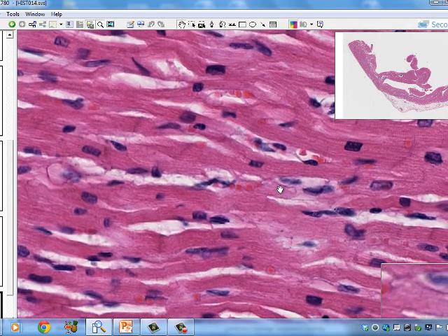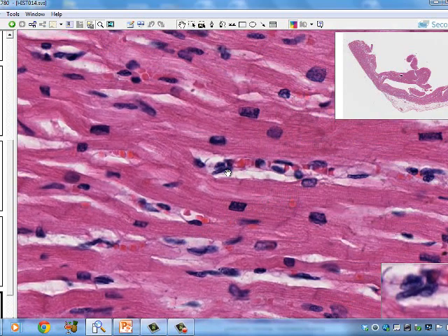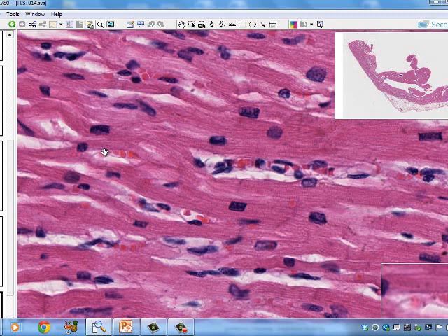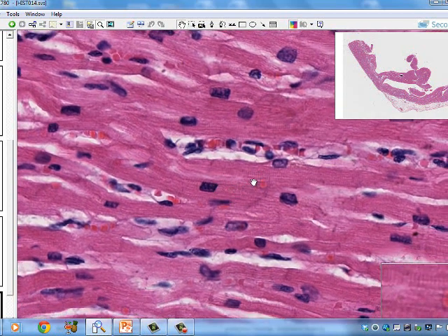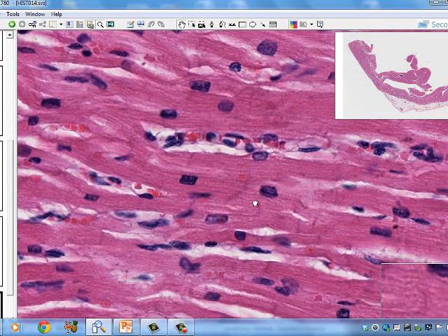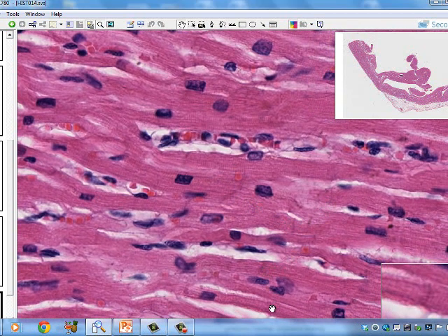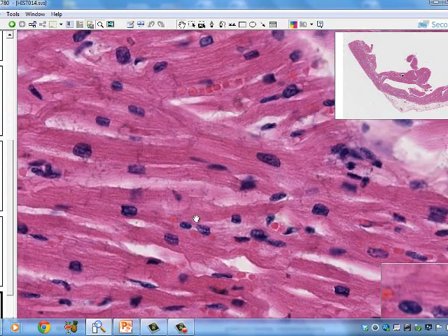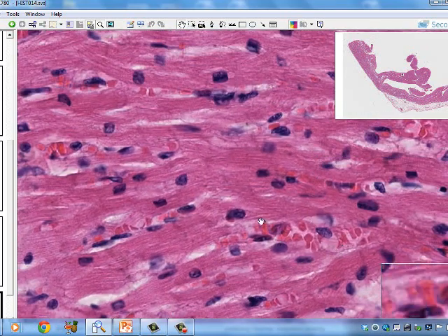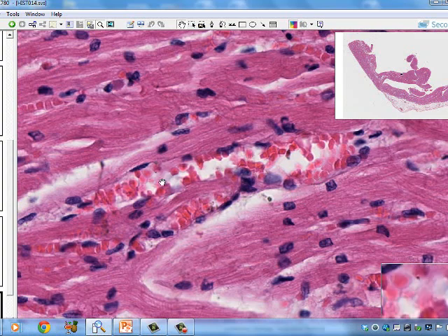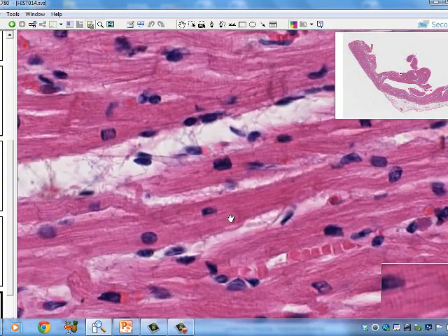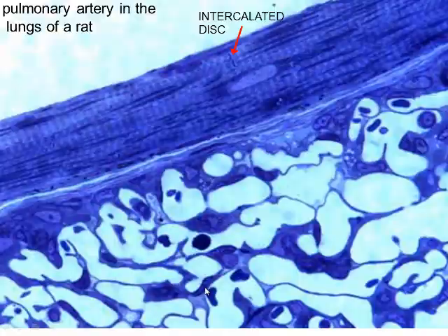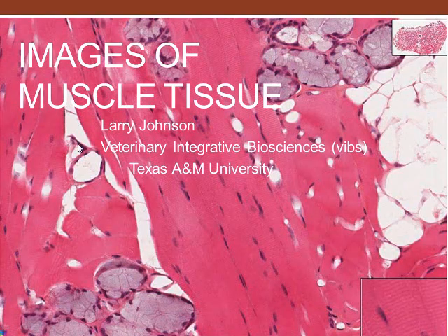Looking at slide 14 of the heart, the nucleus is in the center of the cell and the cell is striated — striations are visible very nicely showing the A and I bands. Capillaries with red blood cells and endothelial cell nuclei are visible. The darker bands are the intercalated discs, which you do not see in skeletal muscle. These cells branch, unlike skeletal muscle. Small veins are visible in the tissue. This concludes the presentation on images of muscle tissue.